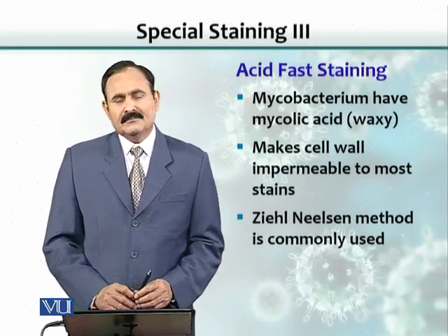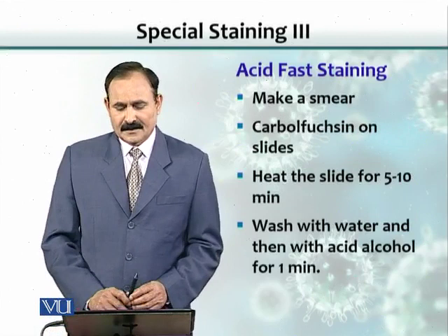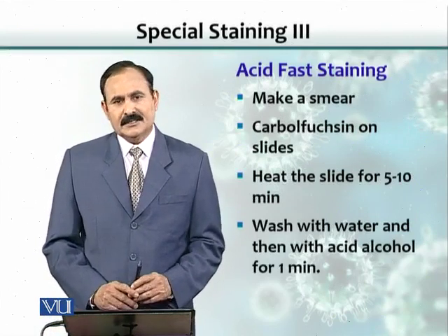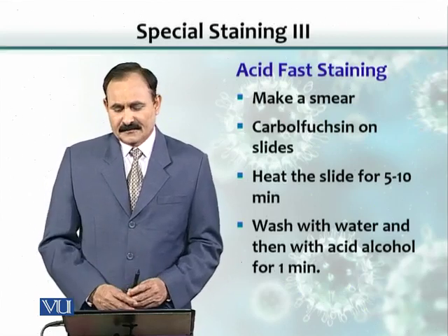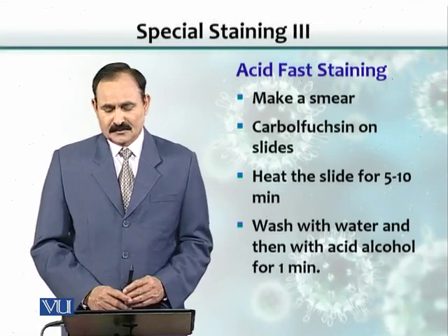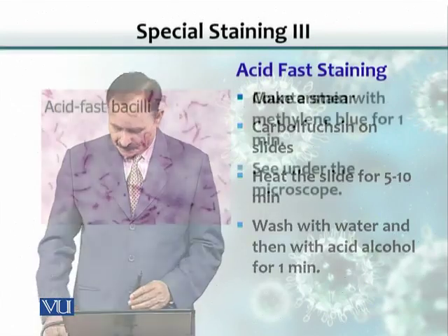The Ziehl-Neelsen method is the most commonly used method, in which you make a smear and then you flood the smear with carbolfuchsin and then heat the slide along with the stain for 5 to 10 minutes. And after that, you wash with water and decolorize using acid alcohol.